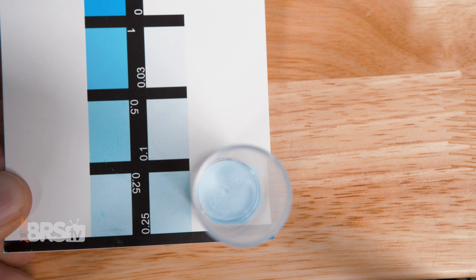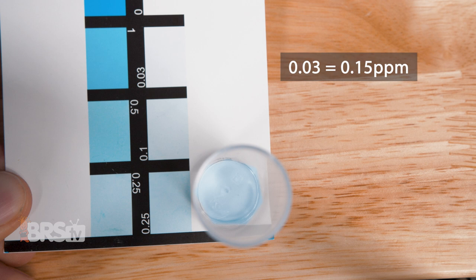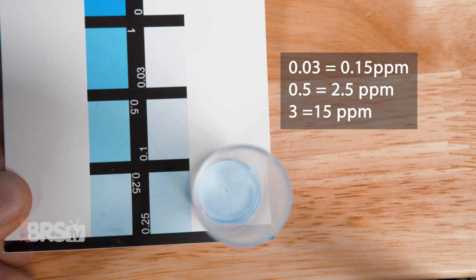Once you find the correct color, take the corresponding value and multiply it by five. For example, a reading of 0.03 on the chart multiplied by five would be 0.15 ppm. A reading of 0.5 on the chart would be 2.5 ppm, and a reading of three on the chart would be 15 ppm.